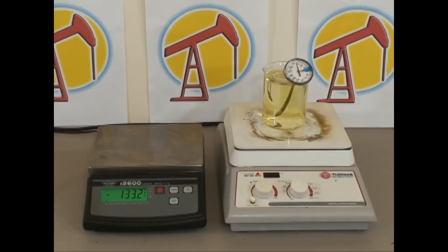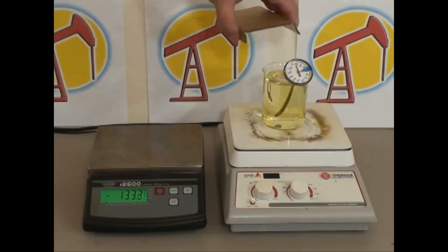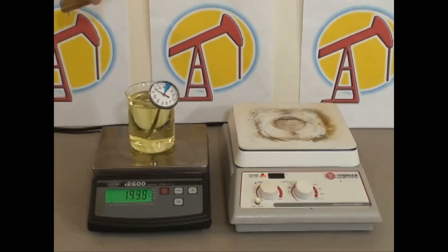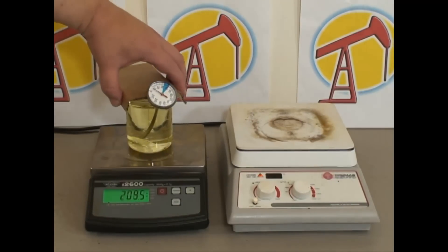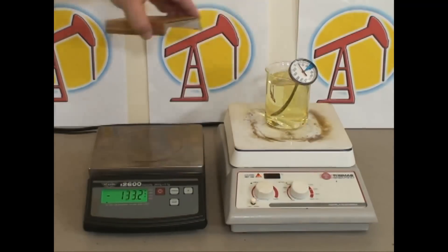It's finished boiling and we're ready to get our final weight reading. To do that we move it back to the digital scale and take our reading of 189.4 grams. Let's move it back to the hot plate stirrer because it's hot and we don't want to damage our digital scale.